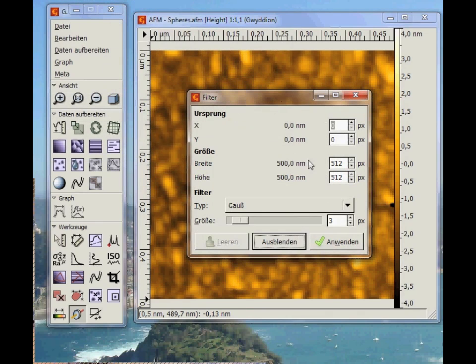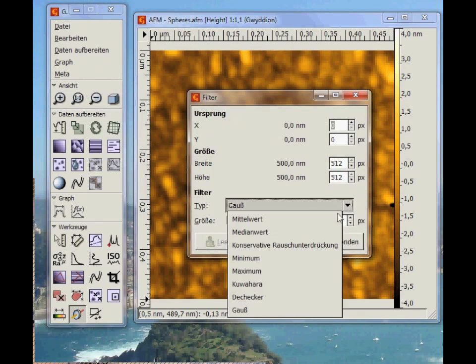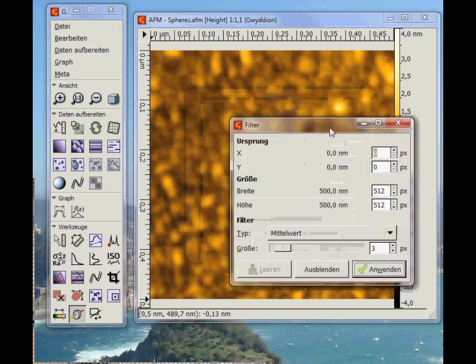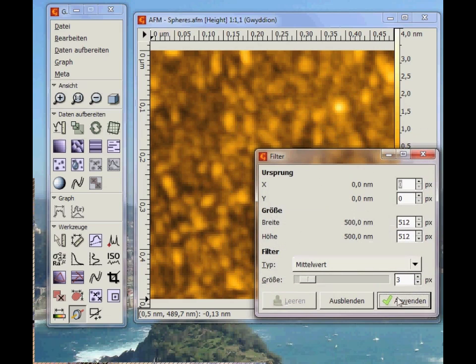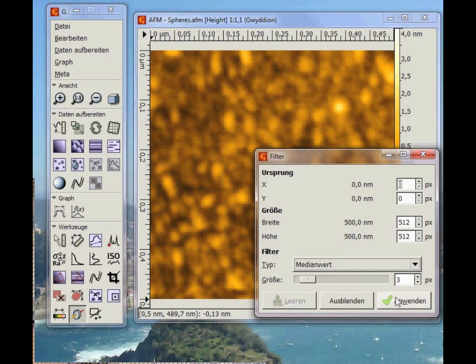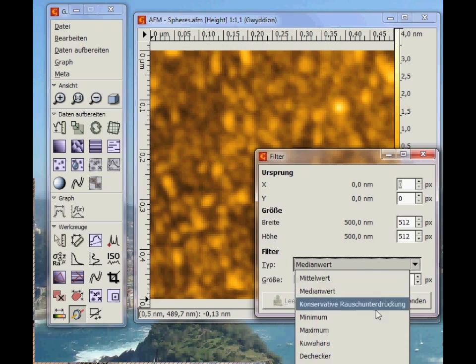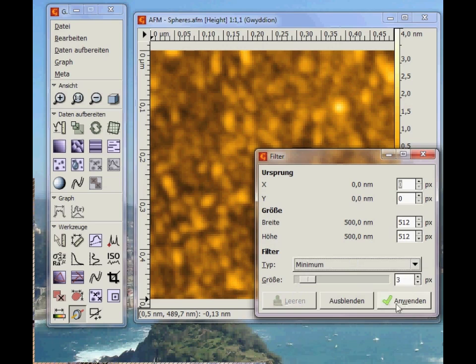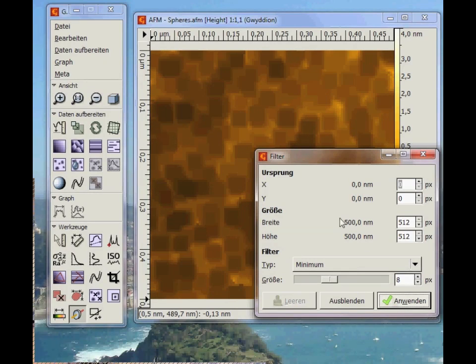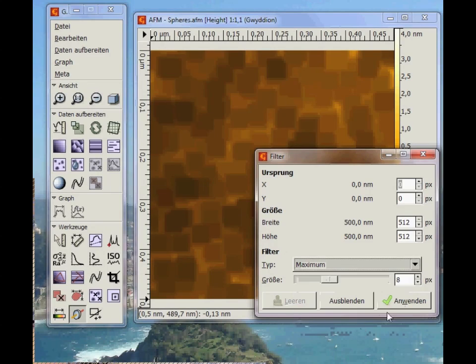The mean value filter looks at all the points around a given point, calculates the mean value, and replaces it with this value. The minimum filter looks for the minimum value around a certain pixel and replaces that pixel with the minimum value. You can also use the maximum filter similarly.